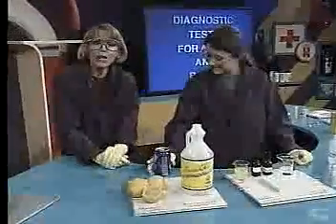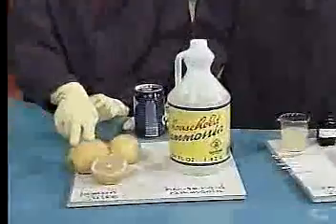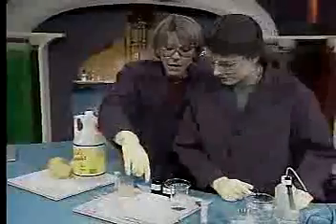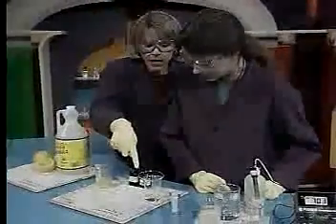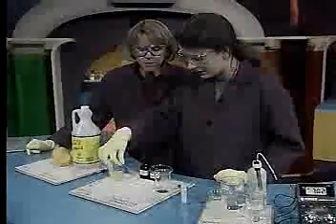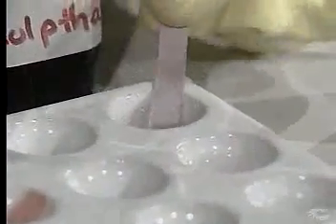That's right. Now, for our acidic solutions, we're going to use lemon juice, and for our basic solution, we're going to use household ammonia. Now, on this spot plate, we filled this side up with lemon juice, and we filled this side up with household ammonia. So, Robin, go ahead with the litmus test. Okay, if I put red litmus in with the lemon juice, it stays red. And if I put blue litmus in with the lemon juice, it turns to red. Okay, what about the household ammonia? I'll put red litmus in the ammonia, and it turns to blue. And blue litmus in the ammonia stays blue.